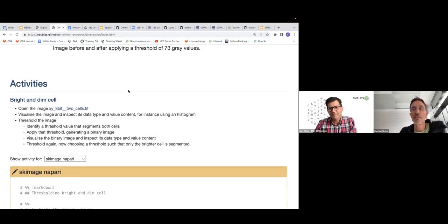First of all, there is this whole spatial omics technology, where people find RNAs in image data. You have this barcoding approach. So spatial omics would be one way.